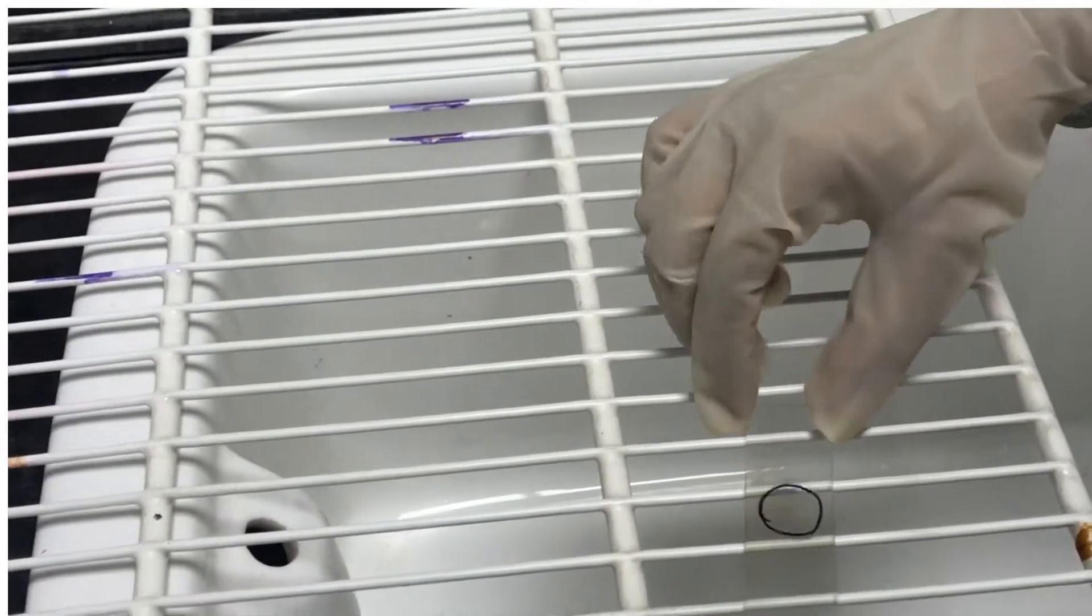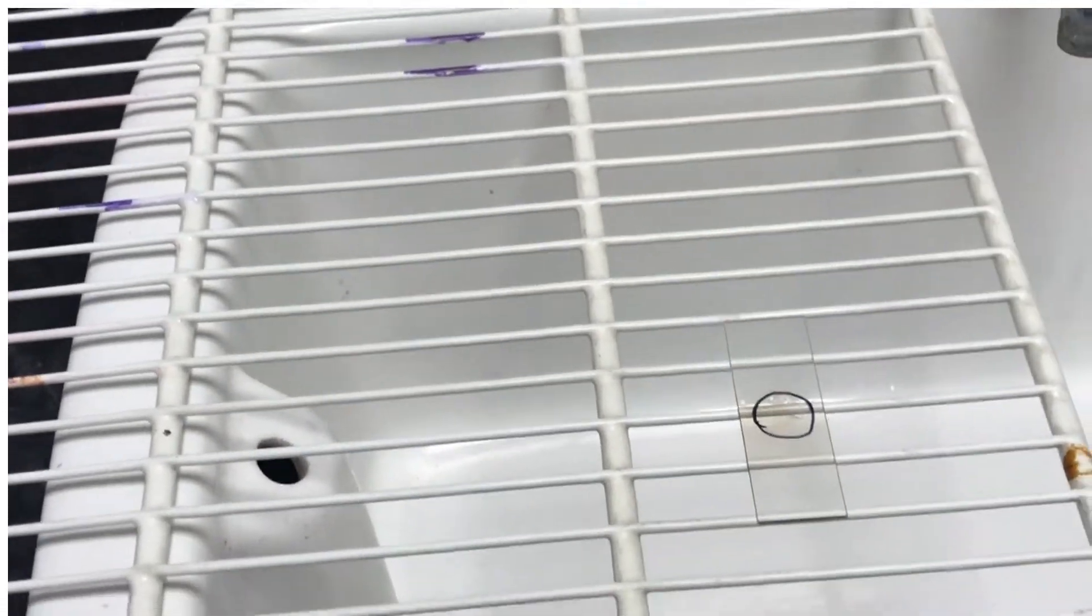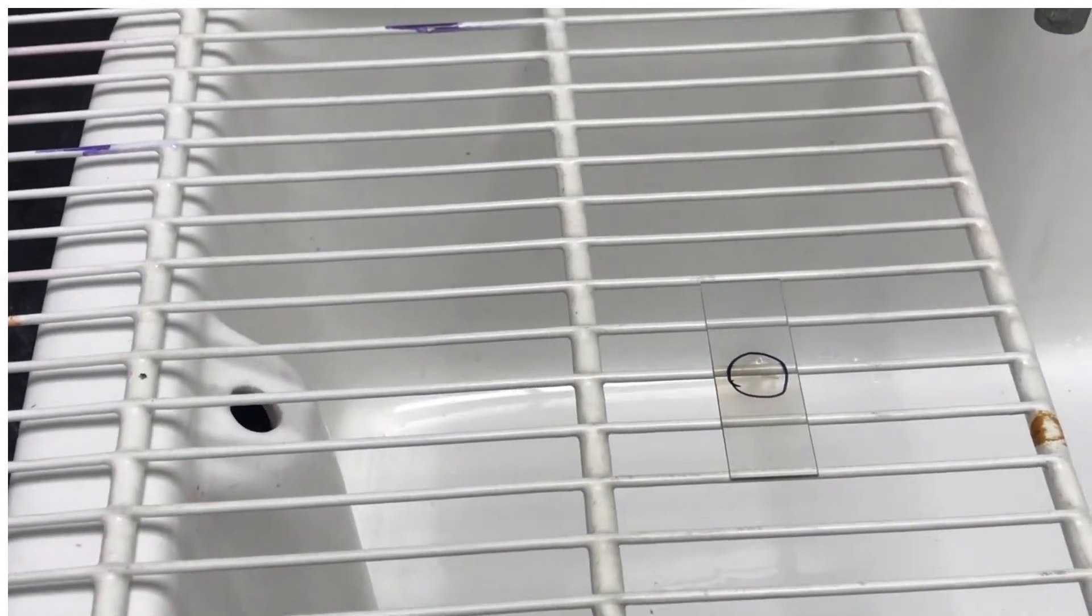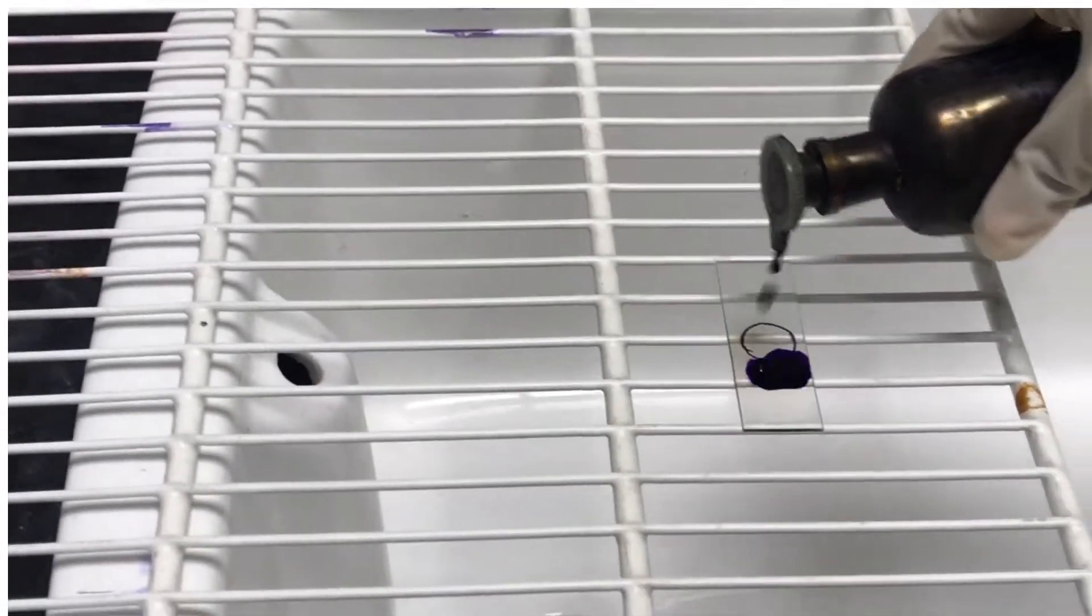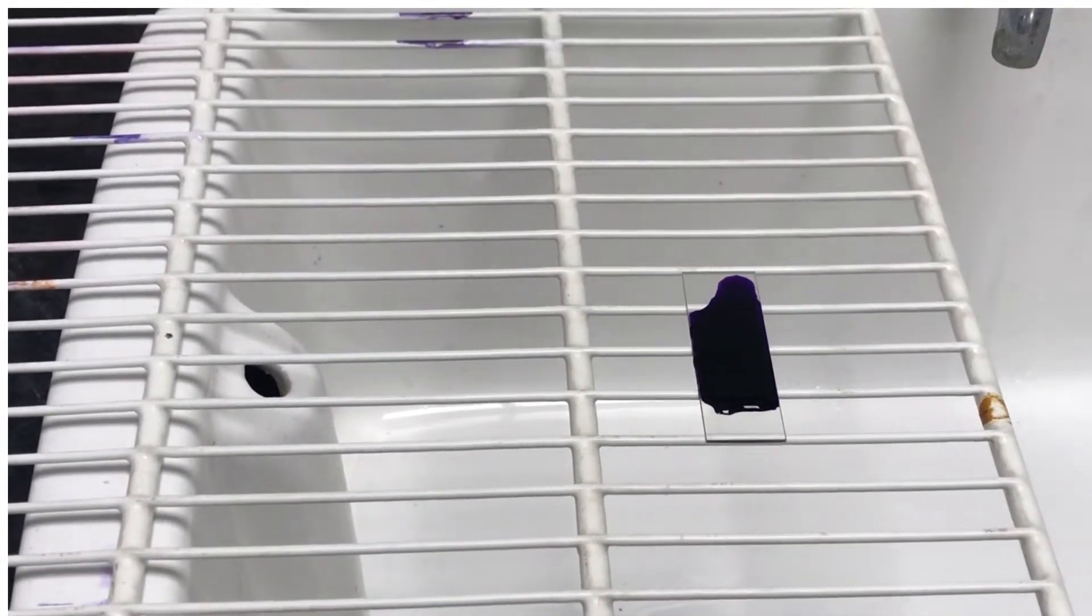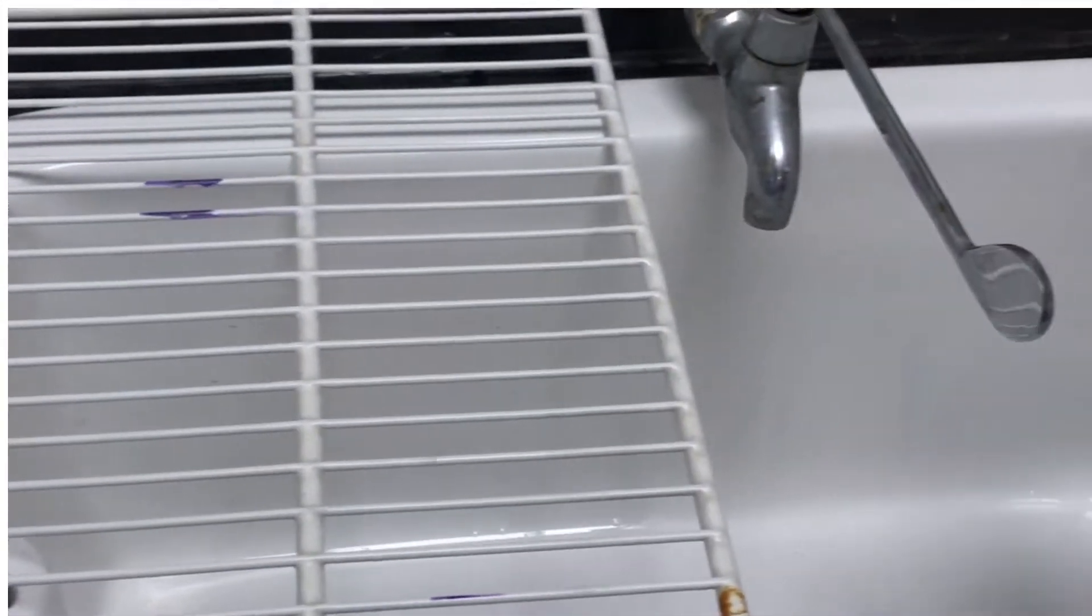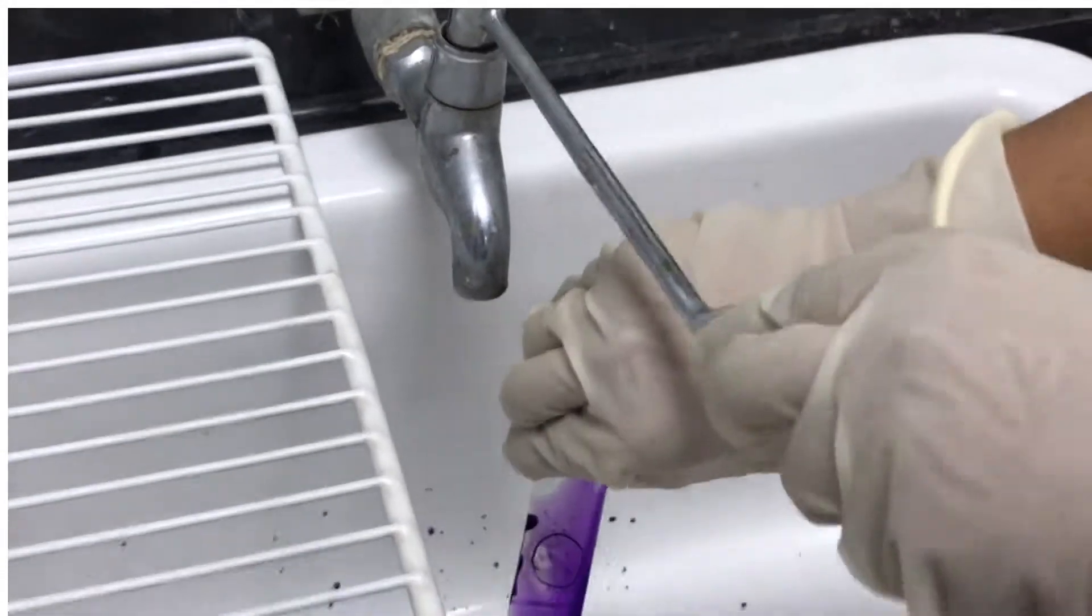Now the smear is ready to be stained. Place the slide with heat-fixed smear on the staining tray, flood the smear with crystal violet and let it stand for a minute. Tilt the slide and rinse with tap water.